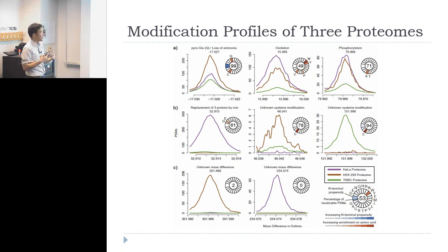expect them to be. So a lot of this is likely due to all of that sample preparation. I wouldn't expect the phosphorylation states to be very different from these different samples, but yet they are different. So there is something happening during sample prep that alters how many of these things that we're able to recover. And then there are lots of other things that were just relatively unique to a particular data set.